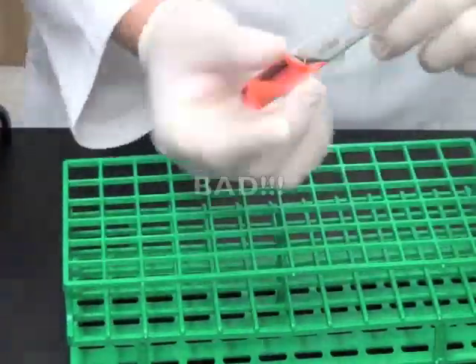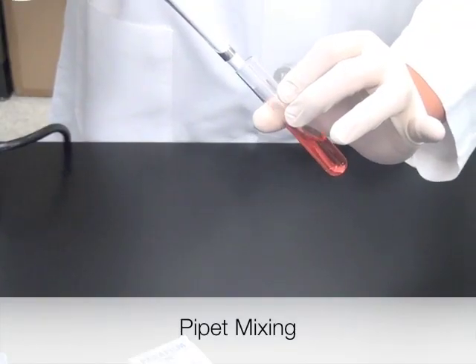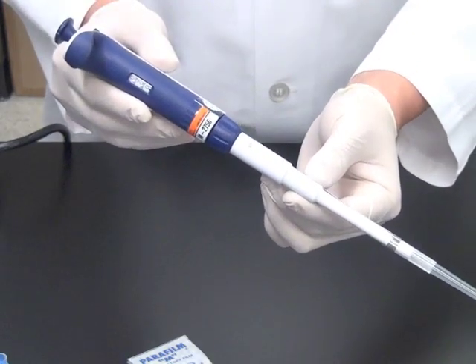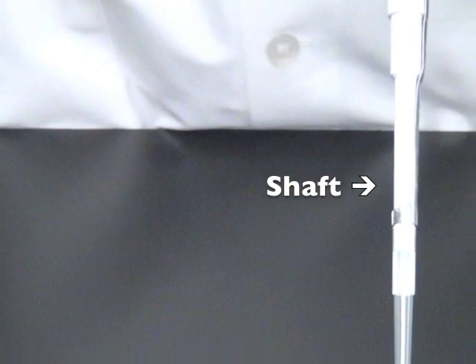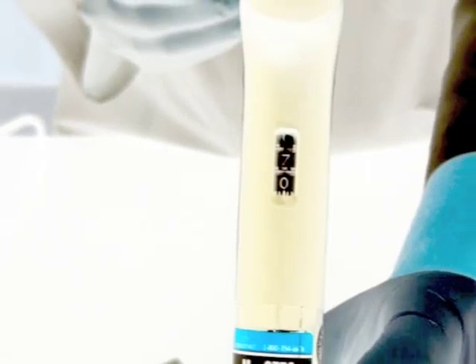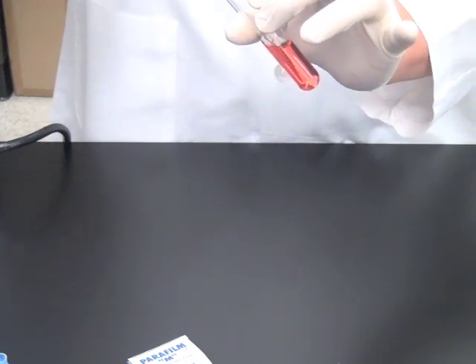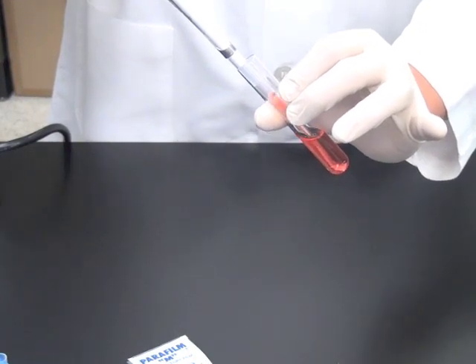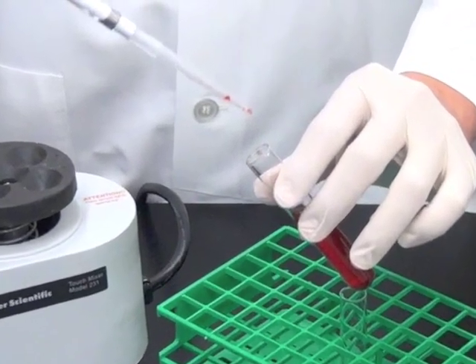Remember that you will lose points if you are wasting supplies and reagents. In some instances, you may want to mix by pipetting. The volume of the solution should never exceed about 80% of the total capacity of the pipetter, and be sure your pipette is set to only 70–80% of its maximum volume. Once set, take up and dispense the solution a few times. This procedure has about the same energy input as vortexing, which could also result in a breakdown of the solute's chemical structure. A disadvantage is that you may also lose some solution in the process.